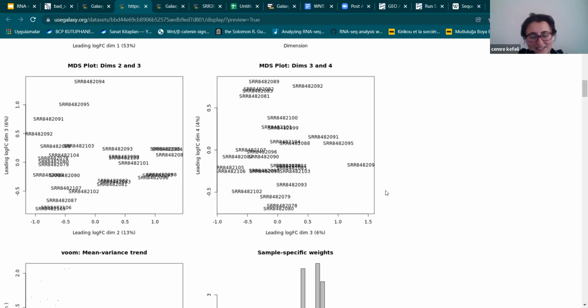There is something I really don't know the detail, but I know that what you say is an issue, and what the people are doing is putting the data already in Galaxy or in some cloud. Galaxy can access Google Cloud or Amazon Cloud, so there is a way that you don't need to move the data because these are public data.